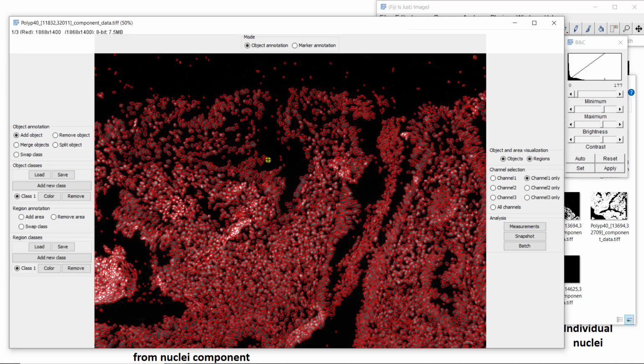So next, we're going to see how we can train a Mask R-CNN classifier, see the results we get, and then how we can combine Mask R-CNN and UNet to try to improve the results a little bit.